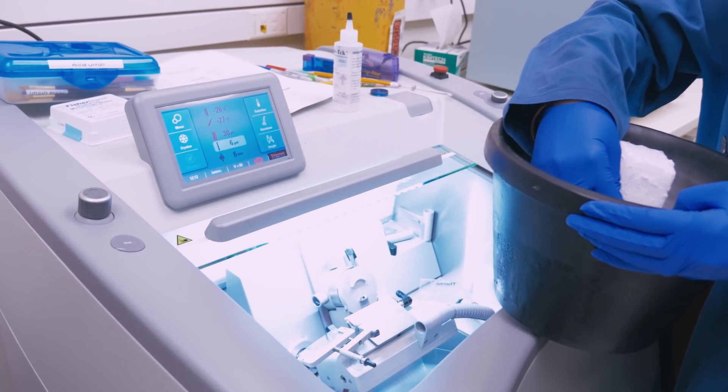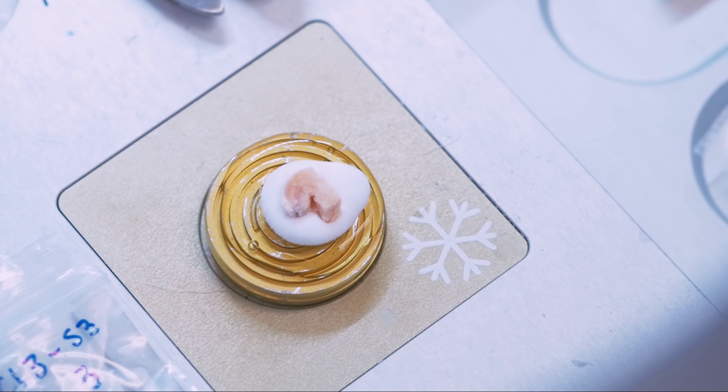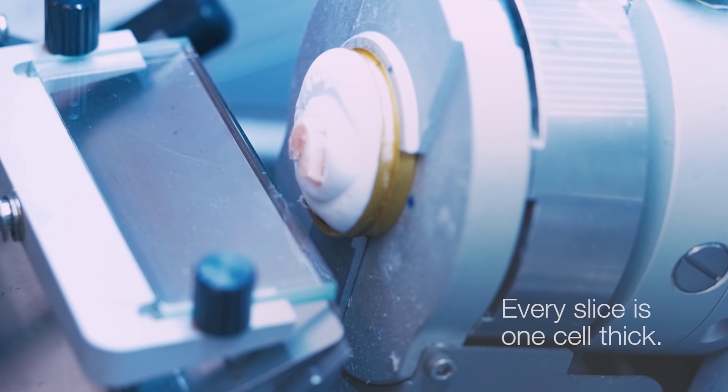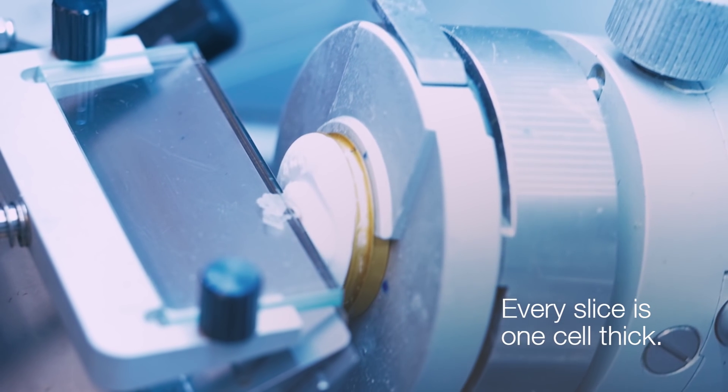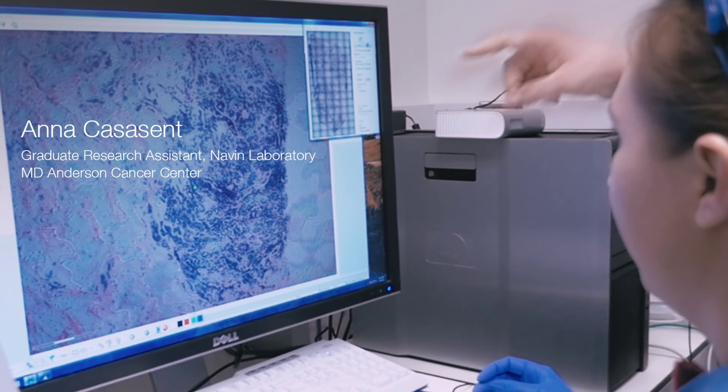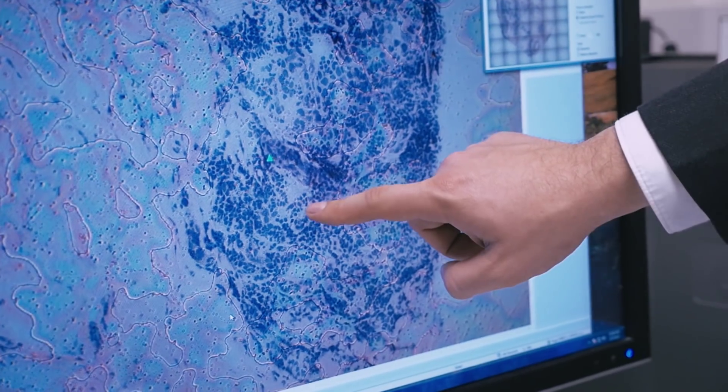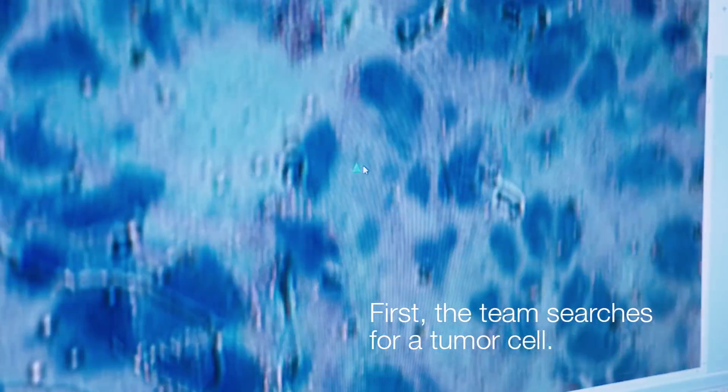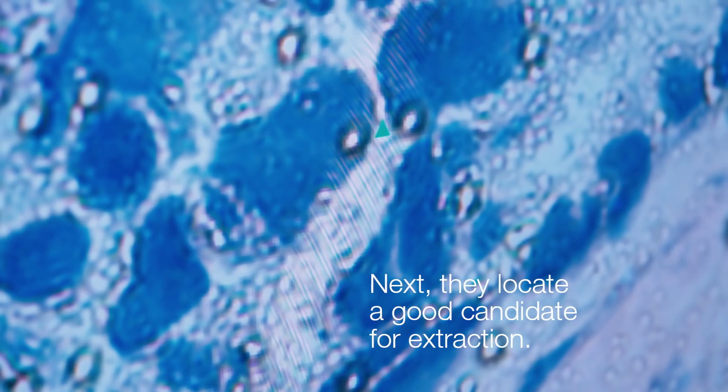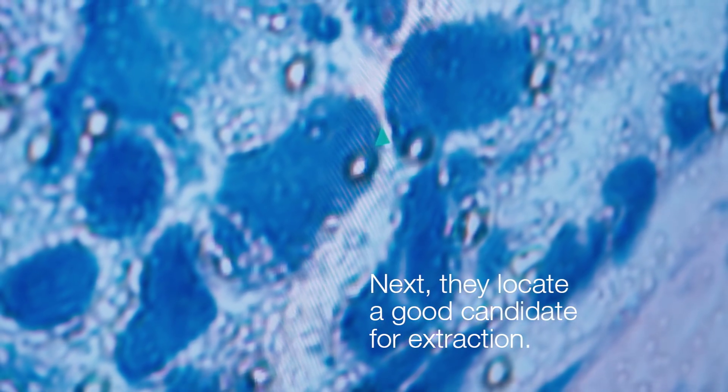So this is our cryomicrotome system, which allows us to keep the tissue frozen while Anna goes through and cuts it with a very fine blade that will cut sections that are only one cell thick throughout the tissue. We're going to be looking at an early stage breast cancer called ductal carcinoma in situ. We'll see ducts at the earliest stages of tumor development where the tumor cells have started to proliferate within the ducts.